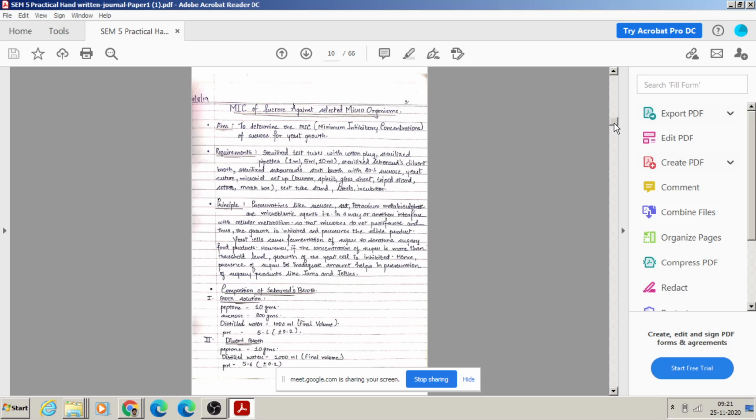In industries like jam, jelly and syrup, you might have seen that the products are highly concentrated, and if a technical person reduces the sugar concentration there, it would definitely invite the activity of microorganisms. So the quality assurance cell of these industries is very cautious about testing the product.